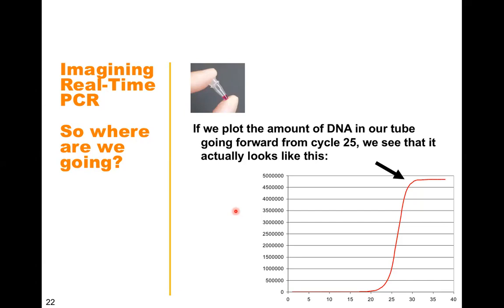As per the standard calculation, the difference will be 2 raised to power 3, so 2 raised to power 3 will be an 8-fold change. So we can say that compared to the cut margin sample, in case of cancer there are 8 times more molecules, because the CT value difference is 28 and 25.